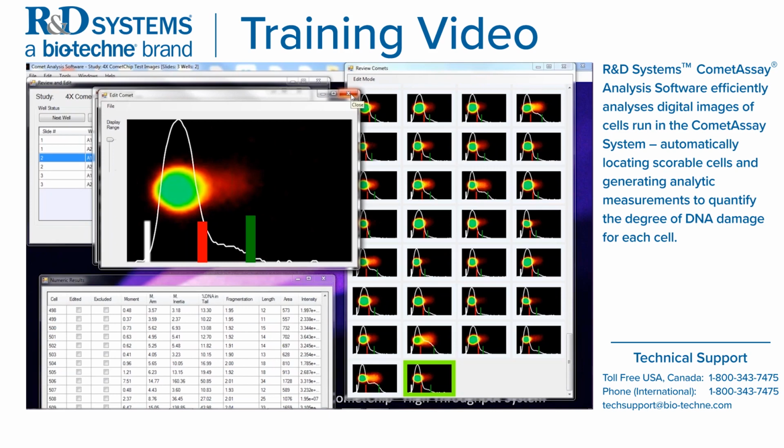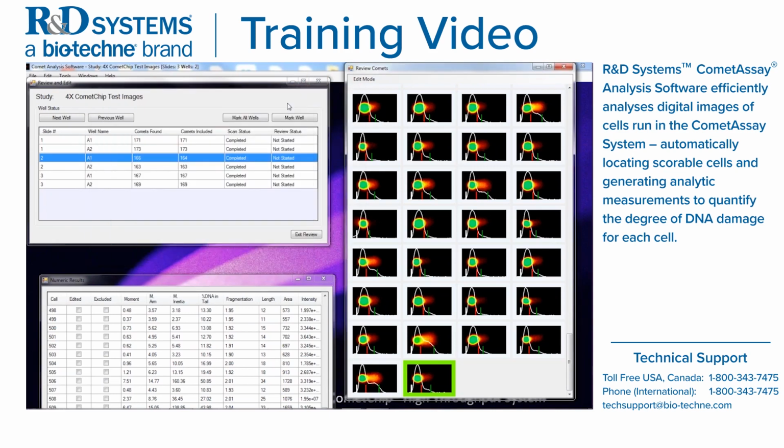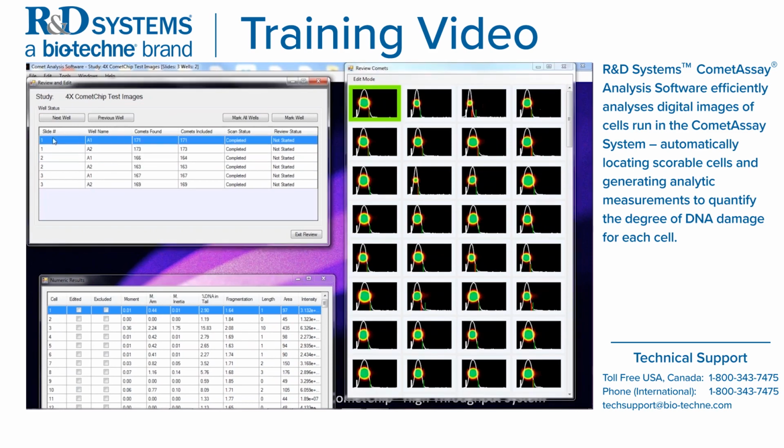Okay, so let's click out. Like I said, as you're reviewing each one individually, say we're on slide 1, I could have marked that well as review, so it was already completed. This is a marker for you. It's going to allow you to come in and out of the review and know where your position was previously.